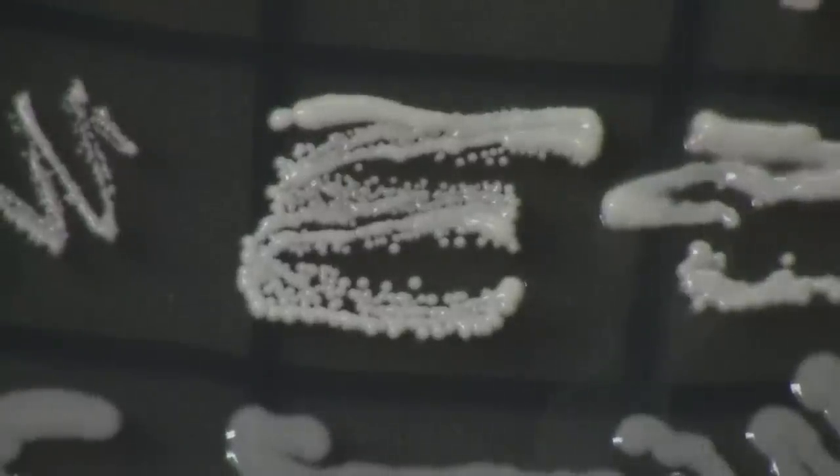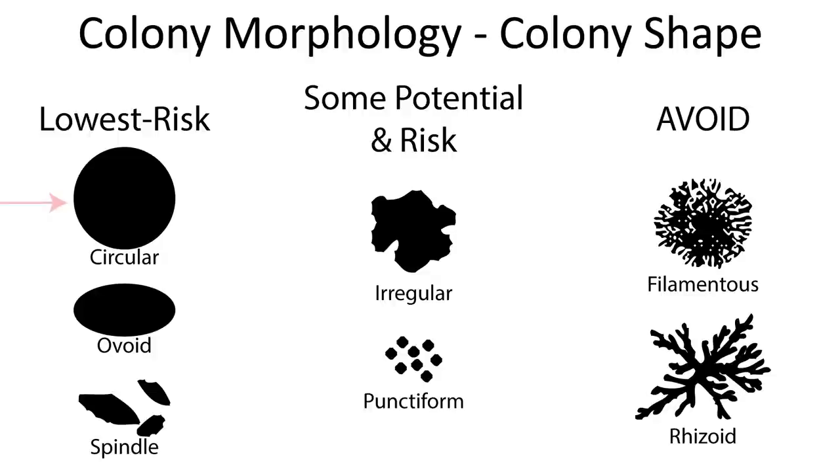The major thing we're going to look for when selecting organisms to keep is their color — white or colorless are what we want to pick. But there are a few other things to look at. We typically want colonies that are circular in shape, looking like a disc from the top down. Things to avoid include cases where instead of one single round colony you have a bunch of small colonies that form into a bigger one, anything filamentous or webby like those fungal colonies, or anything irregularly shaped — even oval or streak-like colonies.